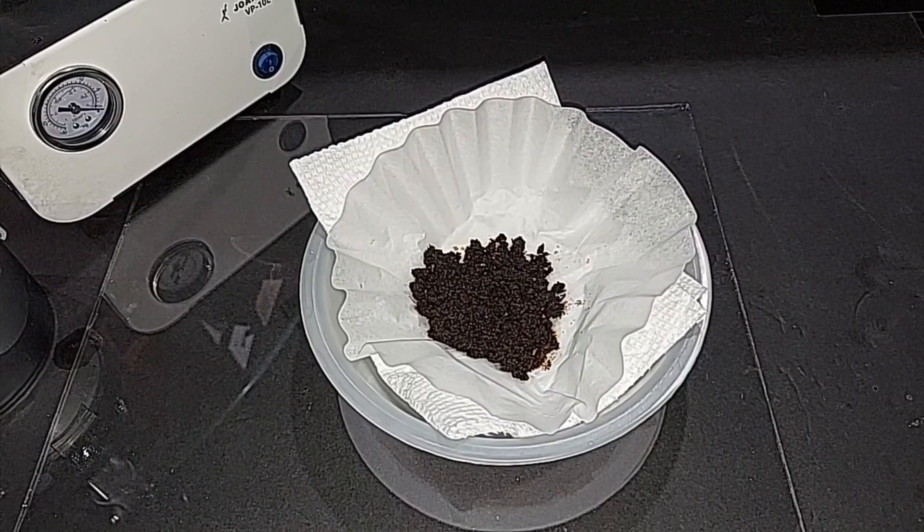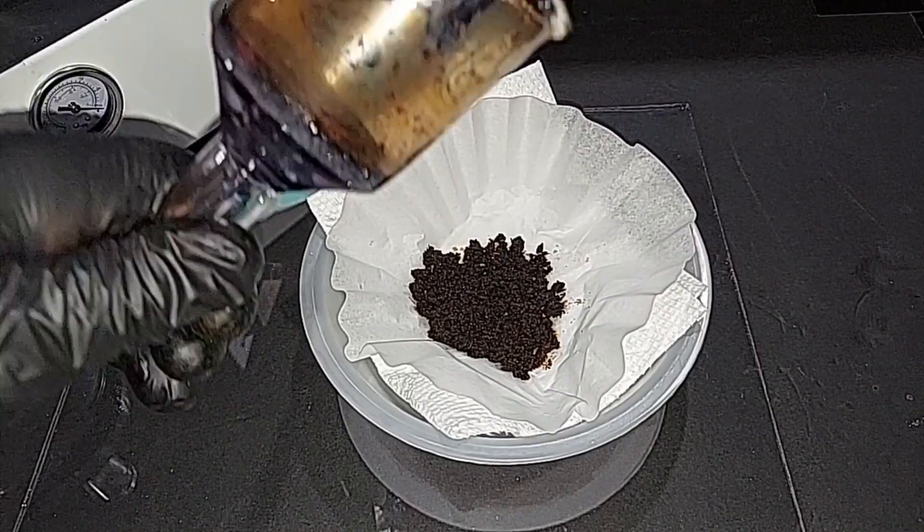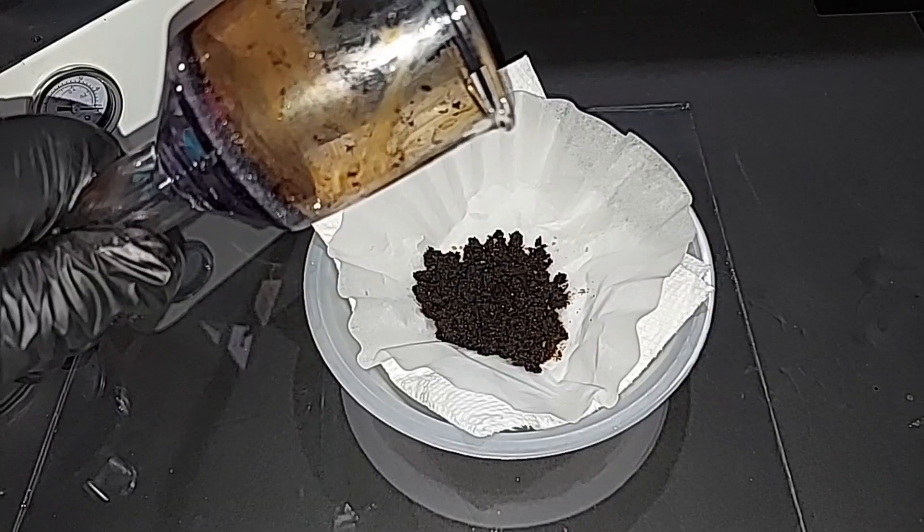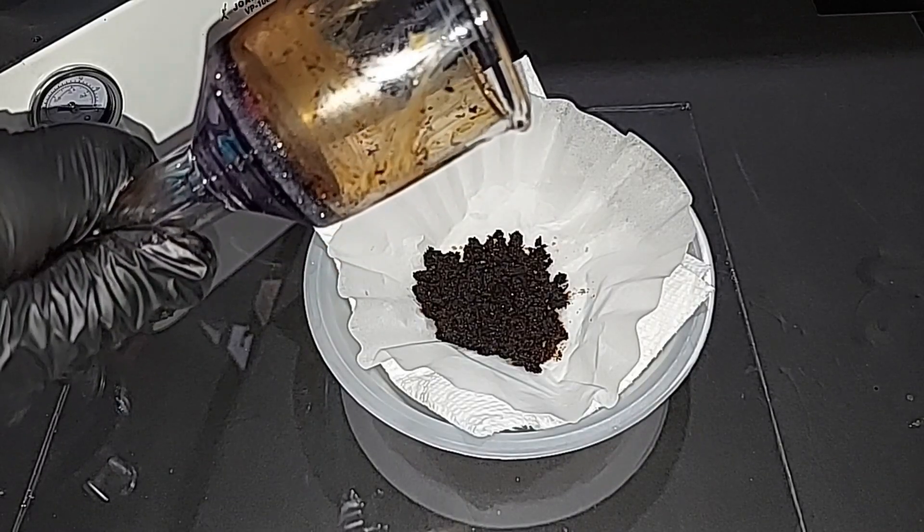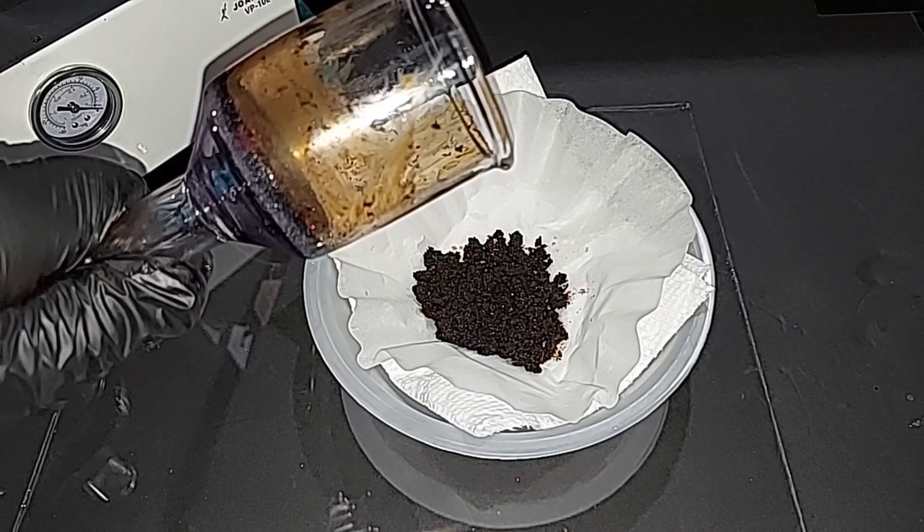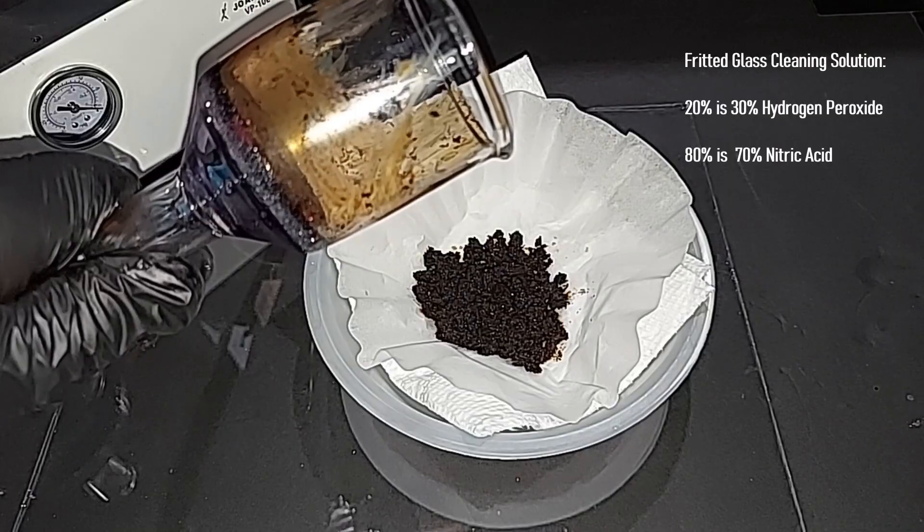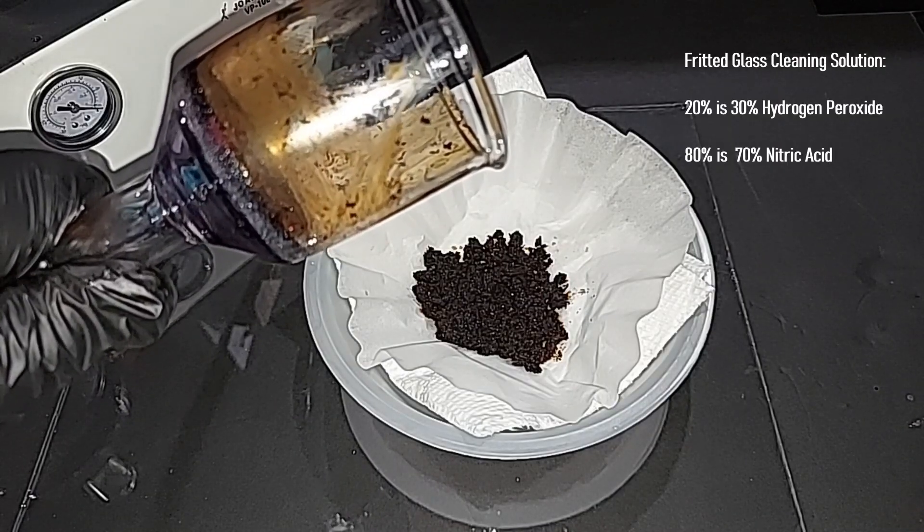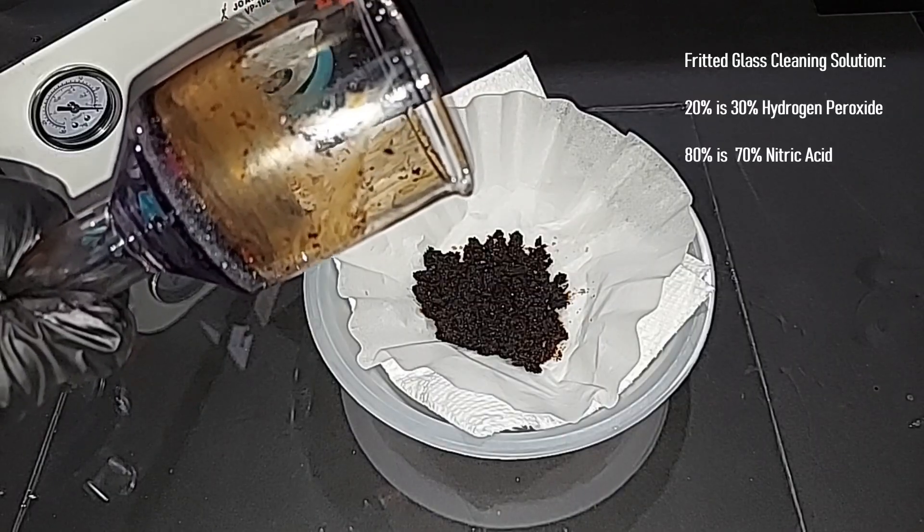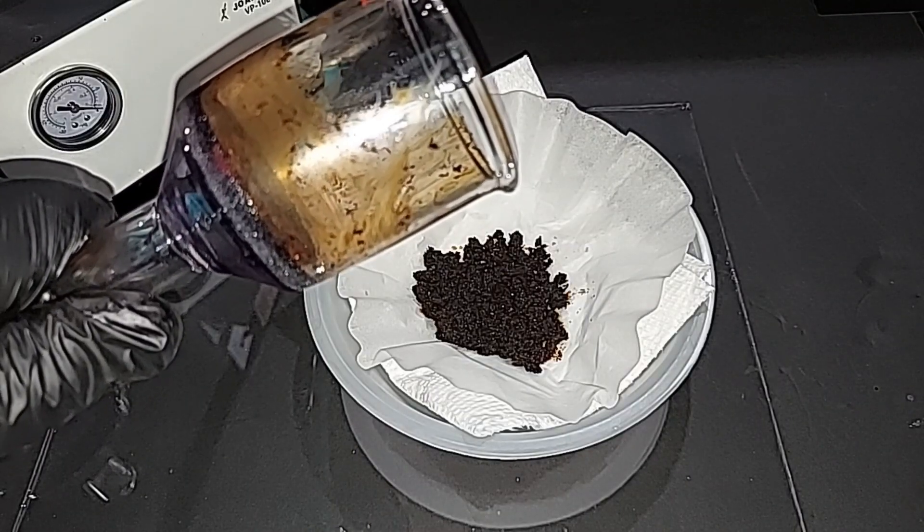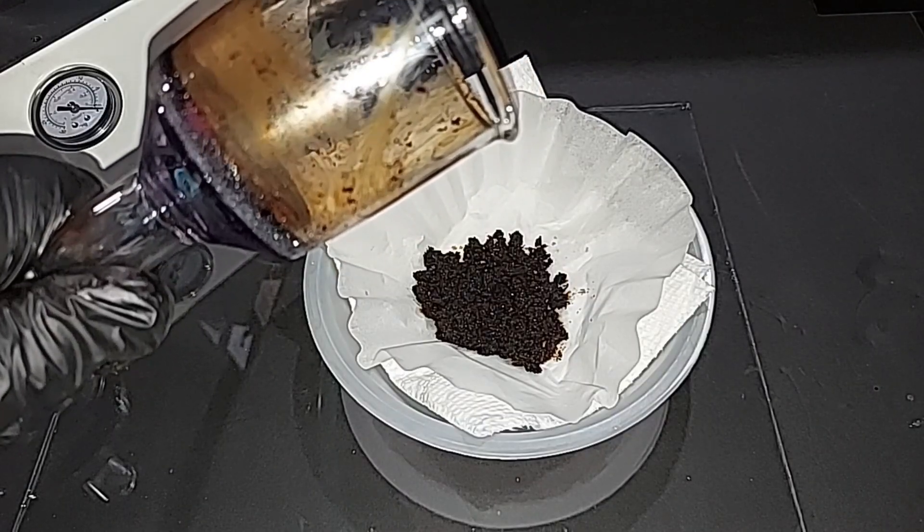When it's dry, we'll weigh it. A couple of comments here. To clean my fritted glass earlier when I filtered it to get the manganese dioxide out, it took a lot of trial and error, but I mixed 20% of the solution as 30% hydrogen peroxide and 80% as 70% or concentrated nitric acid. I put about 50 milliliters in here, and within 10 minutes it was white. I couldn't believe how well it worked.